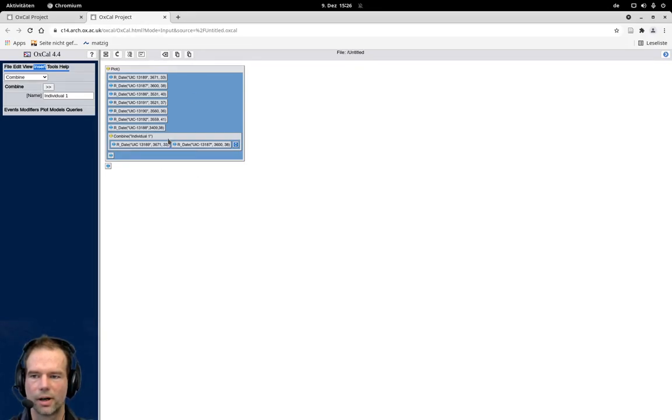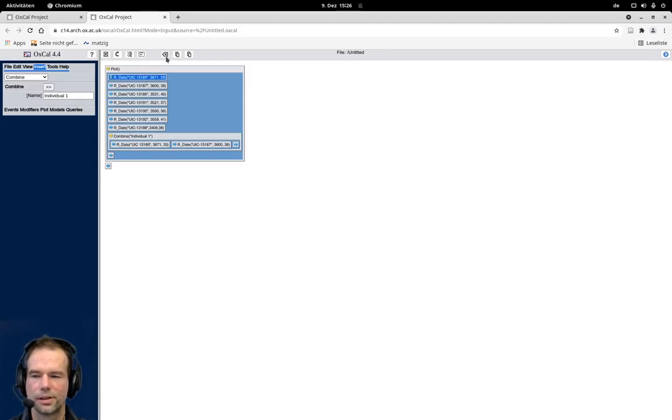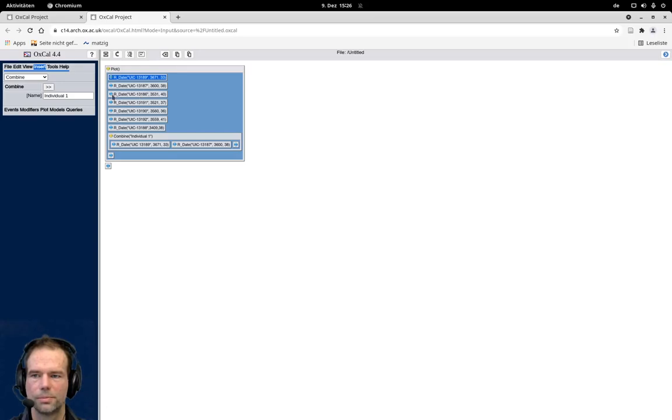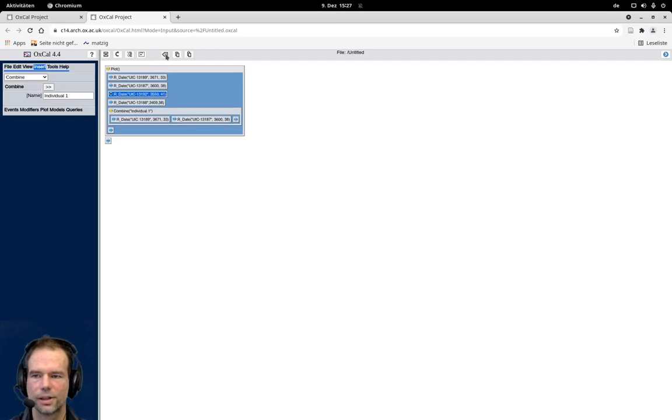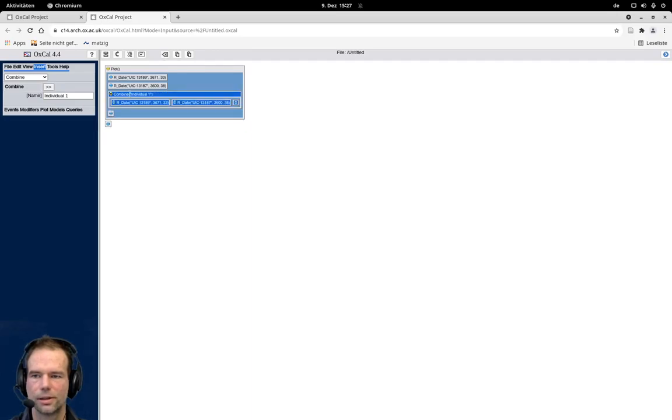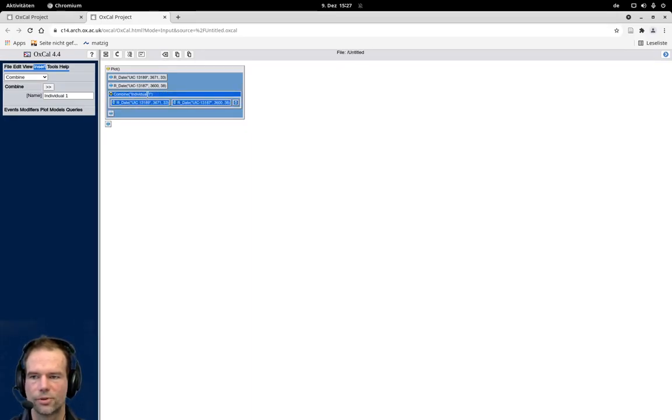And now I can delete these two dates, but we leave them there to get an idea how the difference will be between the individual dates here. For this I delete all the other dates that we have only these two independent dates and the combined result here.